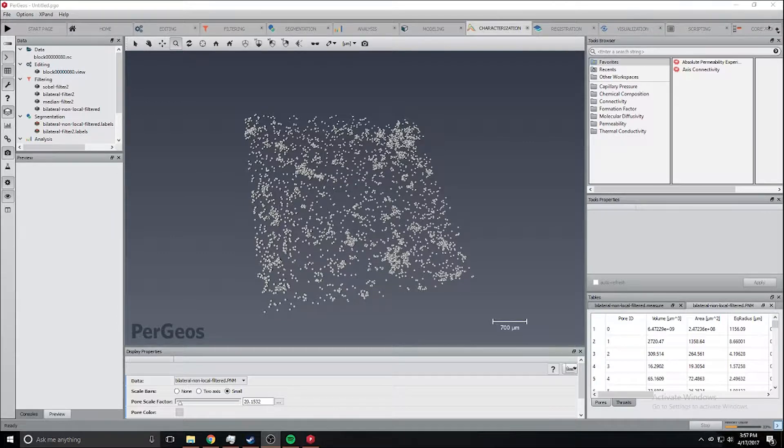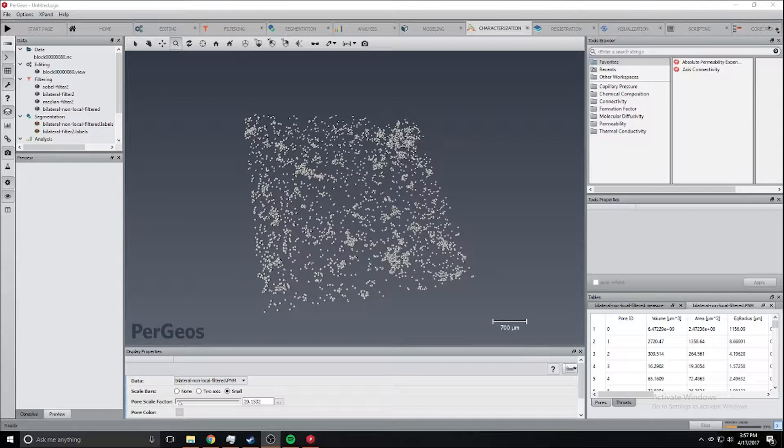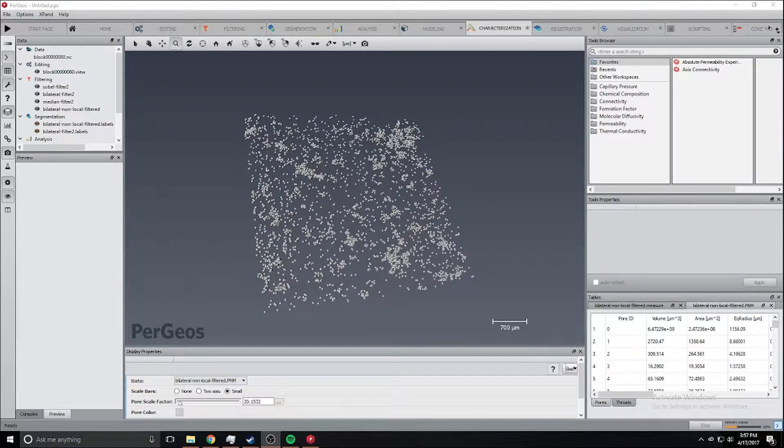Hi, my name is Sam and this is another Pergeos tutorial. In this tutorial we are going to go over how to use Pergeos to analyze the porosity of a MicroCT dataset.